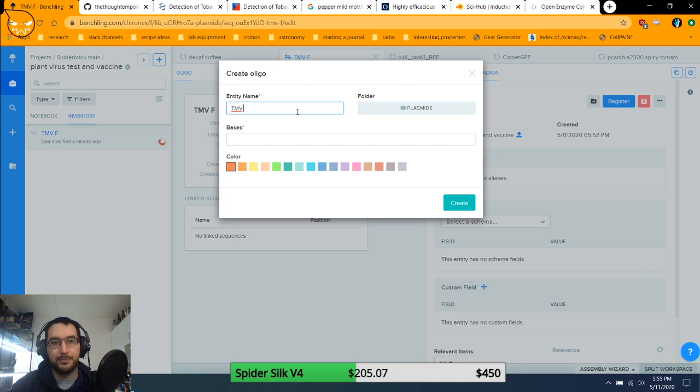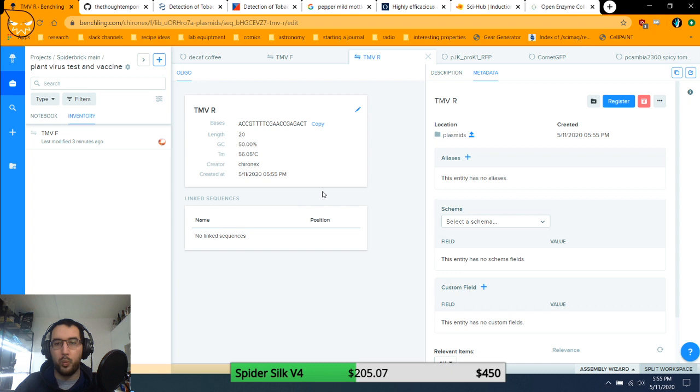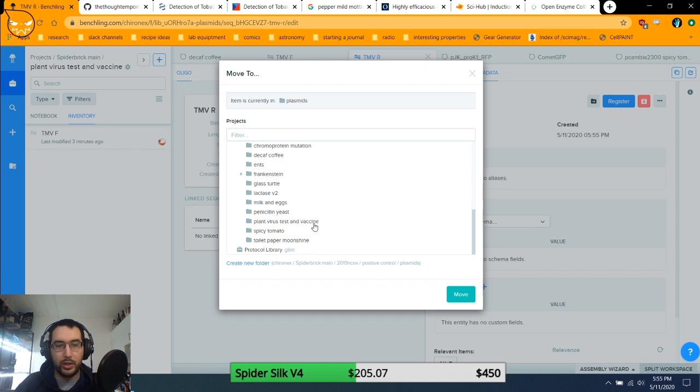And honestly, I don't want to just let emotions out and not give accurate information, because that's irresponsible. Okay, so I'm going to paste that in. That looks different. I'm going to just make sure that I grab the right one. ACC, yes, good, wonderful. Going back to here, great. Now we've got our primers. Wonderful. Oh, again? Why does it keep putting it in that folder? It's really annoying. Okay, moved. Wonderful. So now we've got our forward and reverse.